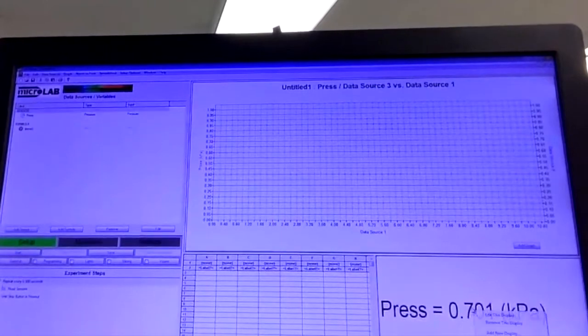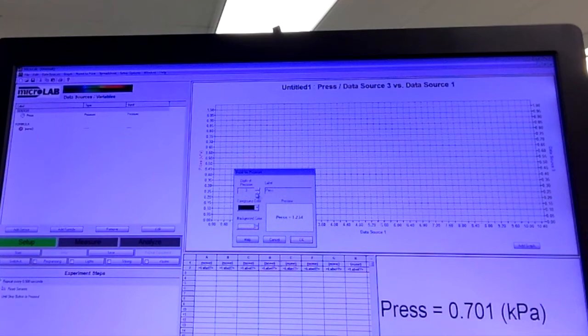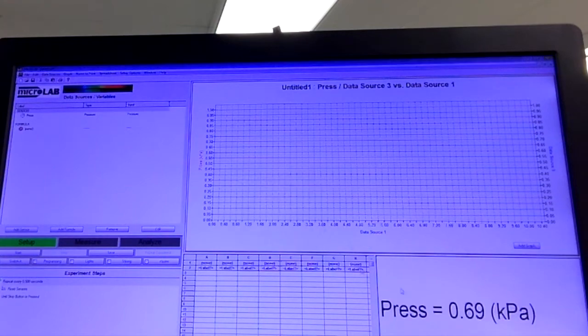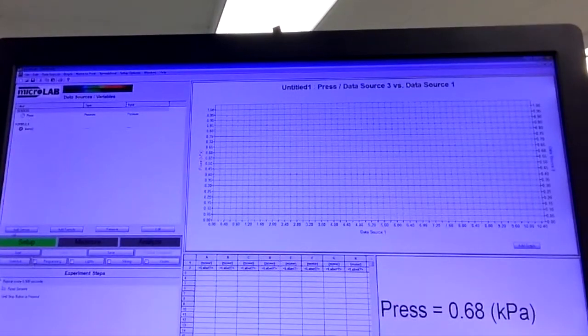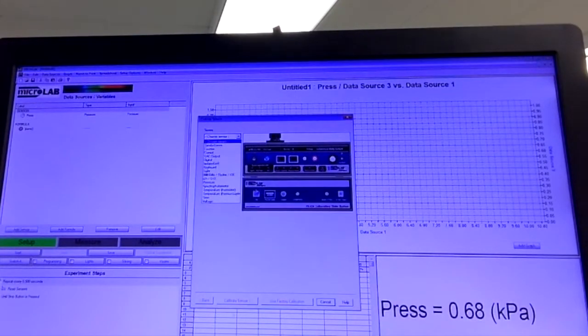Three figures, I doubt it, right? Let's edit this display and make that two digits over there. So we've got more significant digits and they're bouncing around, right? Okay. We also want to add a temperature sensor. We got the temperature sensor.